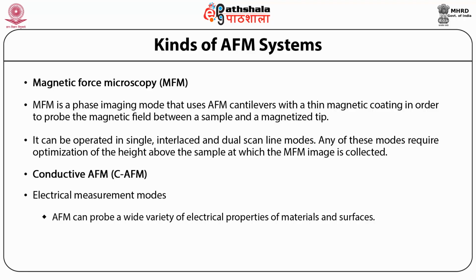Probing properties such as current, conductance, surface potential and capacitance are increasingly important in a number of applications, including research on semiconductors, solar and battery cells, conductive polymers and nanoelectronics.